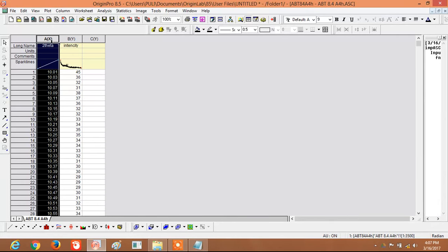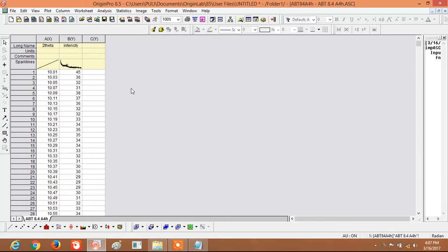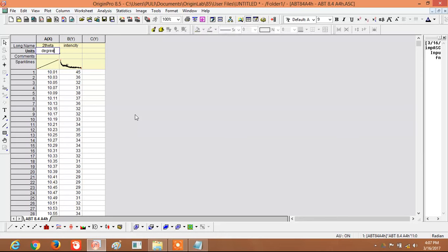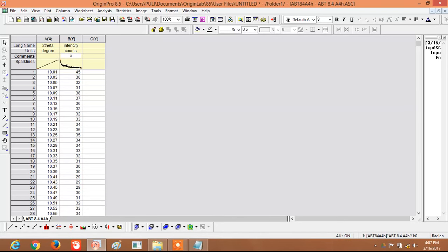Now this column is set as the X-axis. You can also write comments and units here. The Two Theta units are degrees. For intensity units in XRD, we can use 'Counts'. In the comments field, instead of counts, you can write the sample name.